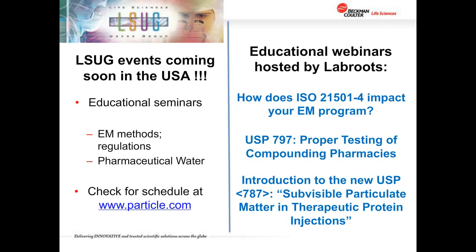ISO is not going to come forward and put a specific time period on as they had before, because it's really significant and relevant for a regulatory agency to put that forward. And if the FDA and EMA want to say for an aseptic area, it should be classification every 6 months, that's not without some logic.